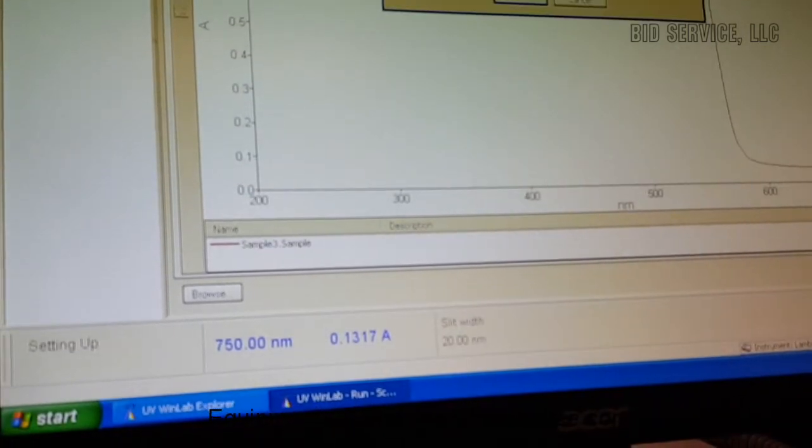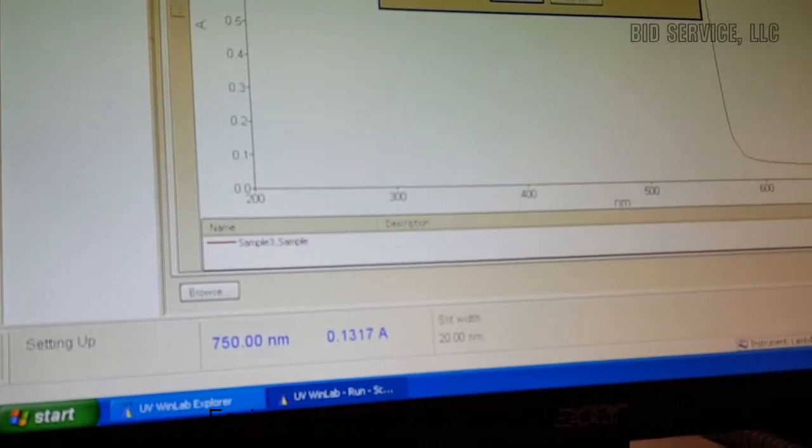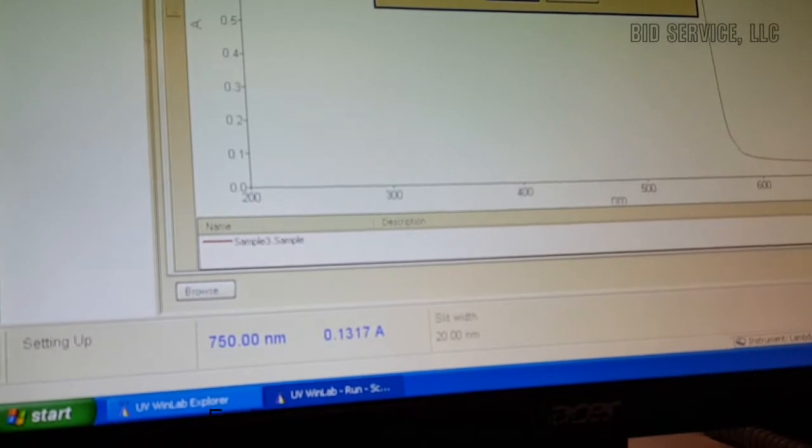The system will be included with a brief operation procedure of this machine.